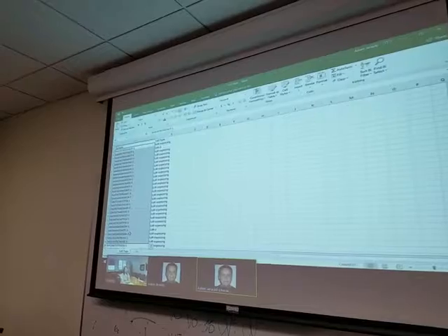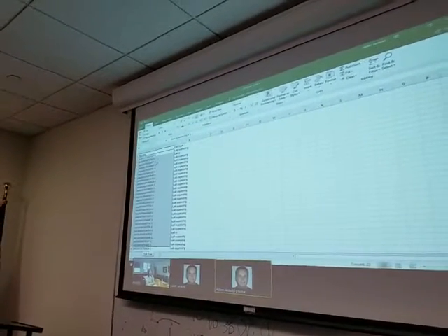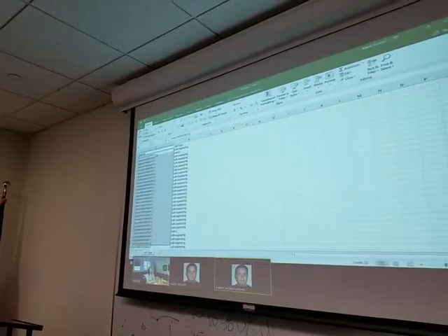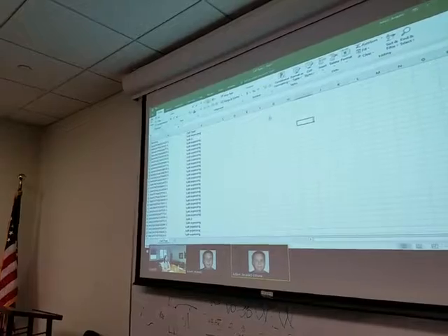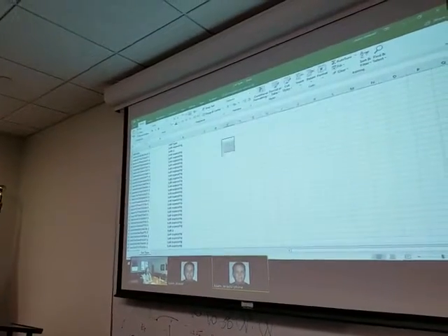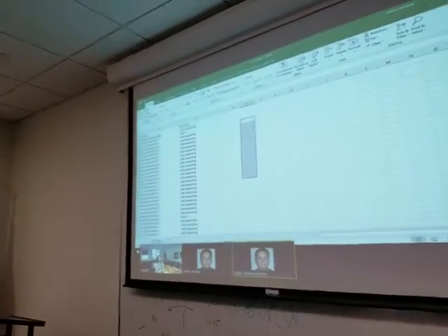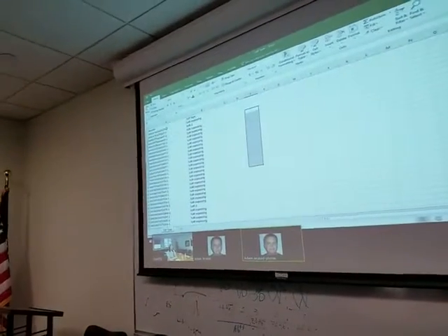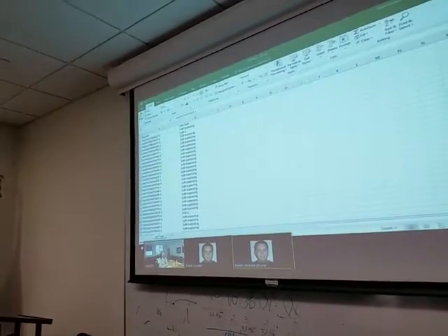Now you are probably going to have to use some other tool to dig deeper into those, because this would be pulling out of the gene barcode matrix, that master table you have of 8,000 cell barcodes and however many genes. But this does allow you to quickly develop a list of cells of interest.